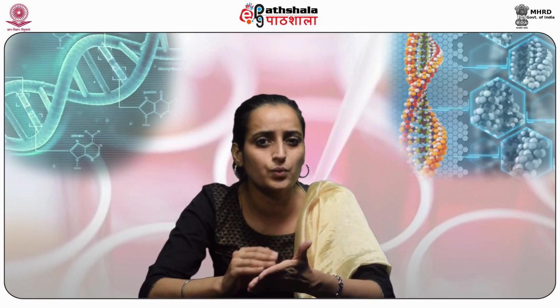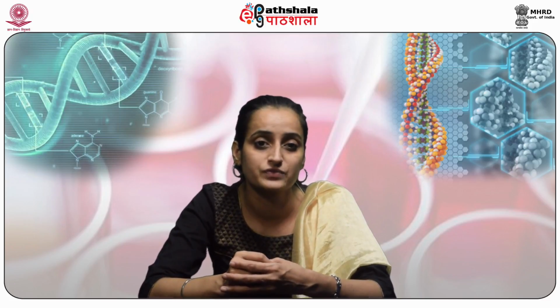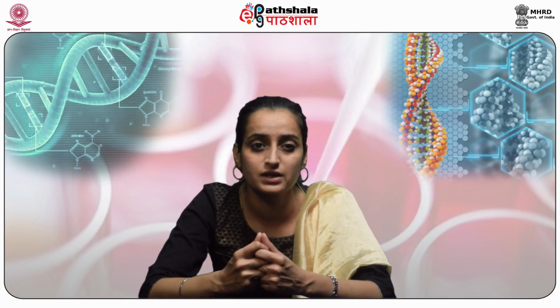To see where the probe has hybridized to the target DNA, a label or reporter molecule is required. Reporter molecules can be radioactive, such as H3, P32, S35, or non-radioactive, such as biotin, digoxigenin, or alkaline phosphatase.